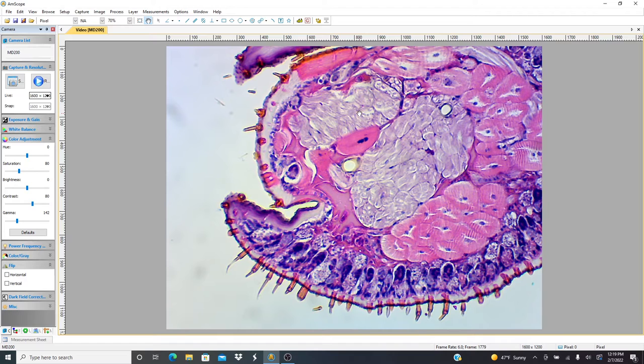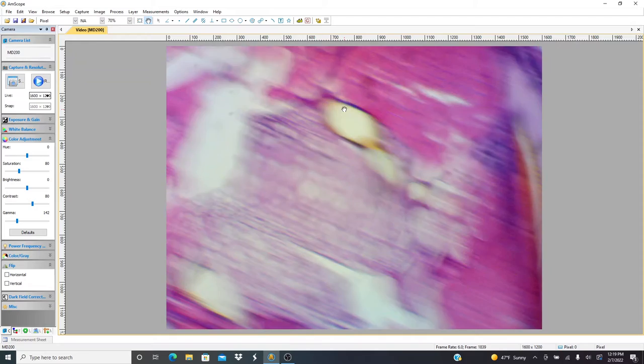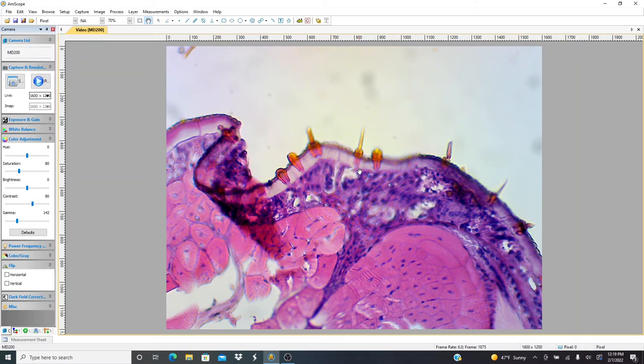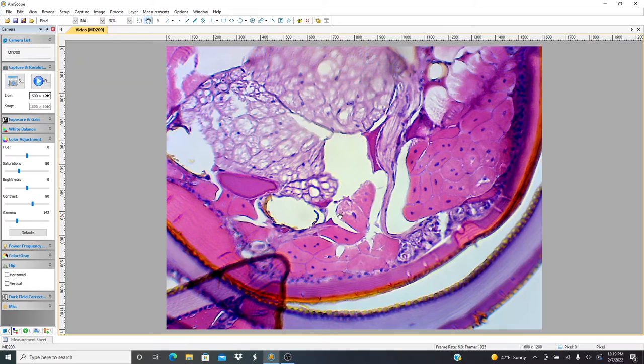Spikes kind of on the front aspect as well, real sharp. I'm assuming these things hurt you. I'm not really sure. That's the whole point of this, is I don't have any idea. I want to look at these under the microscope and then go read about them later. You can see there's some skeletal muscle here in the head.